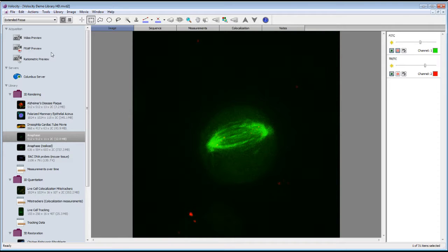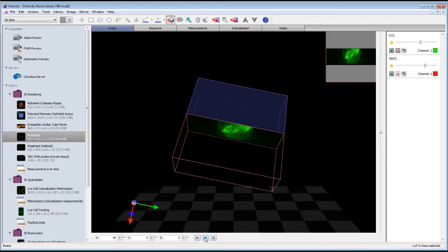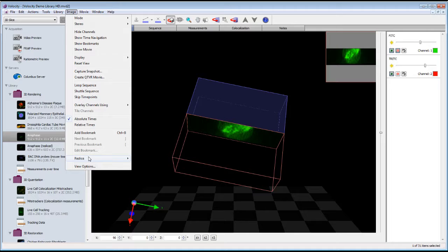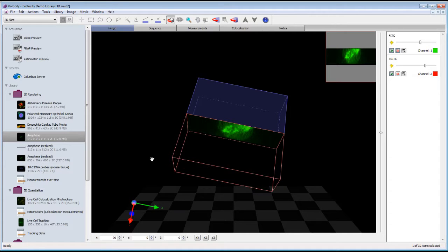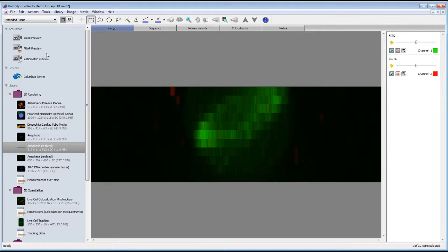To generate an extended focus view of the XZ or YZ planes, however, reslice the data using one of the XZ or YZ preset options, and then view the extended focus mode. Now the XY plane of this image is what was the XZ plane of the original image, so the extended focus merge is of the XZ direction.